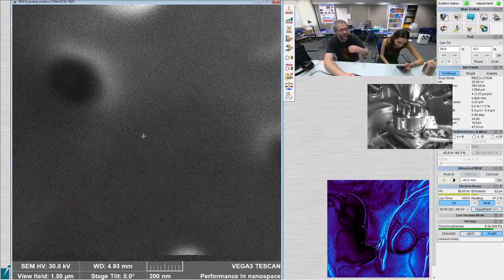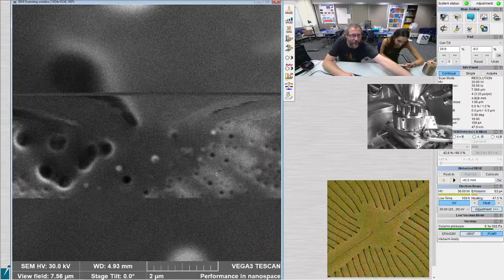Okay. Heat has been adjusted according to the computer.